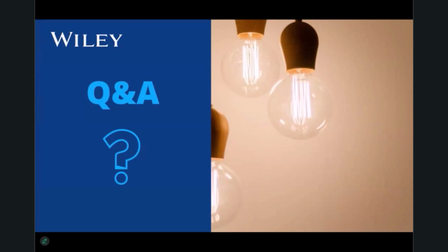How about this? Where did you source the actual structures from? I can answer that. So the data is actually from our collective data collection across all techniques. We ensured that the SmartSpectra records do not replicate empirical data that already existed, so these should all be new.